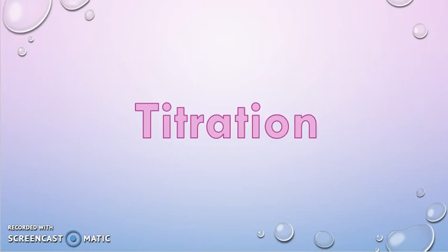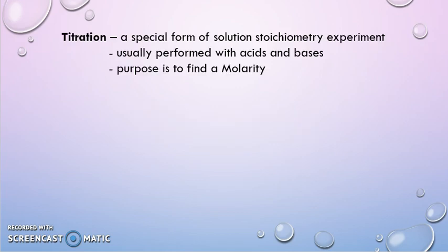So it's time to talk about a very special type of experiment that we do in chemistry called titration. Again, a titration is a type of experiment that we do in chemistry. It has a pretty unique goal as well. Titration is generally performed with acids and bases, but you can perform it with a whole bunch of other types of chemicals, which you tend to find out in AP chemistry. But it has a very unique purpose.